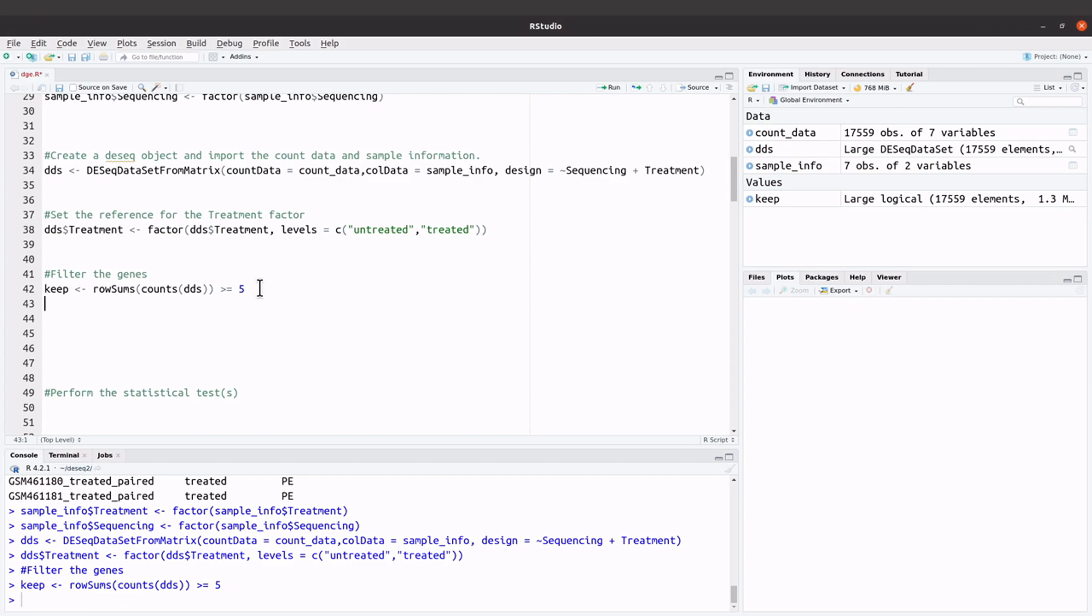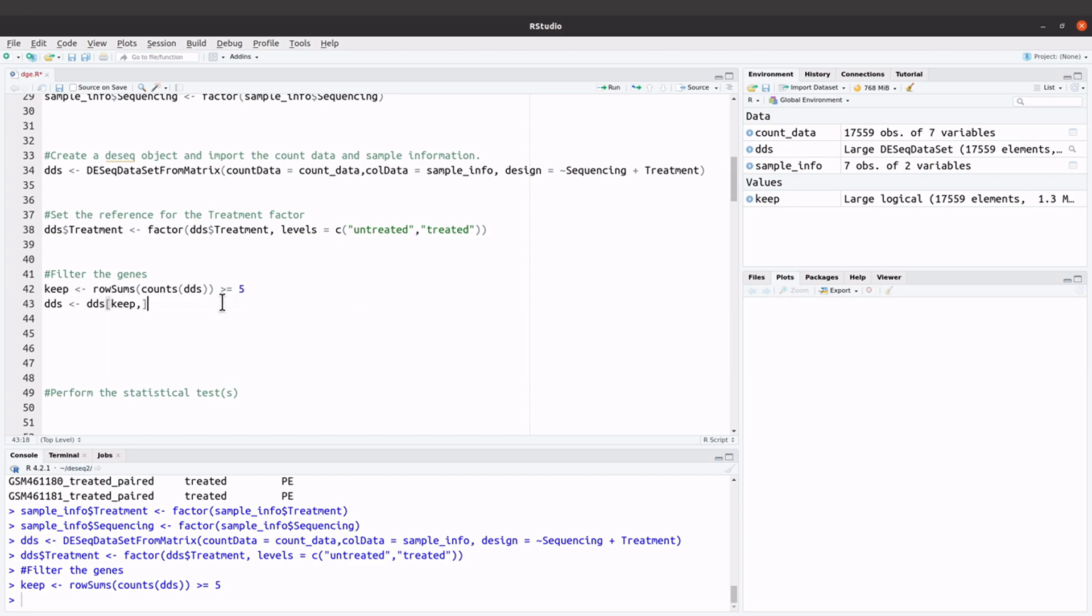So we say dds, and say dds again and we say keep. So what we are doing is we are now selecting the genes that are in the keep variable. So that's what we have here. So first we issue this expression and now we are doing the subsetting to keep only genes with read count greater equals to 5.